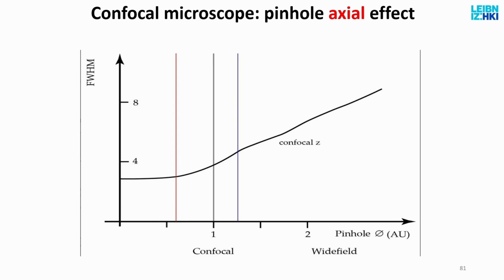And if it's placed on this graph here, where would the range be? Basically, it's hard to place it there, because the role of the pinhole is replaced. In terms of the Z resolution, it depends on the actual pinhole setting.